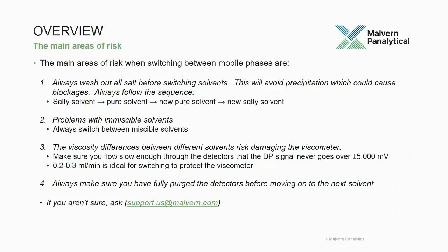In this video, we're going to discuss how to switch your OMNISEC system from mobile phase to mobile phase. And I want to talk through first some of the areas of risk and main considerations, and then a list of the steps that you take to switch from mobile phase to mobile phase before moving into the video demo.